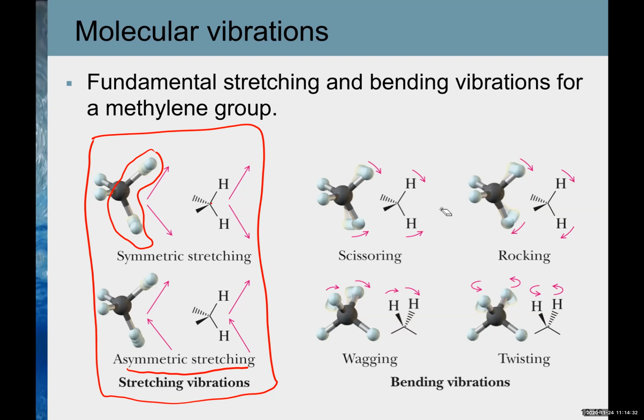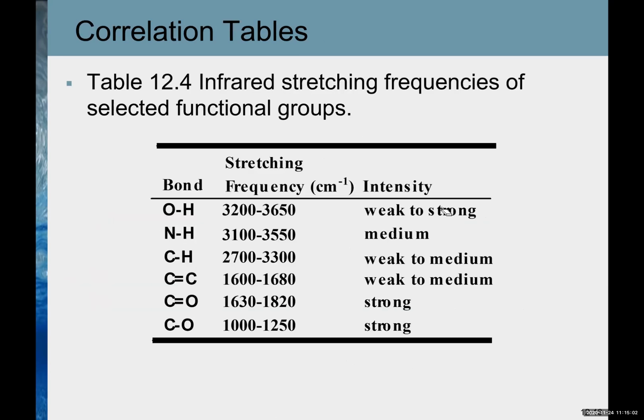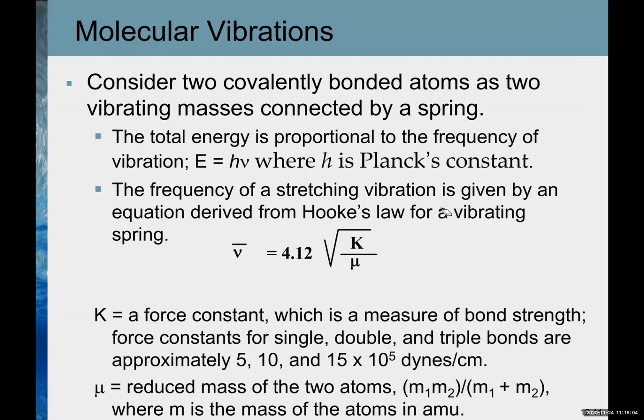And this is the simplest molecule. If you go more complex, we can't even see all the dozens or hundreds of patterns. Fortunately, we don't need to know all those. What we need to know is how to analyze this IR spectrum.